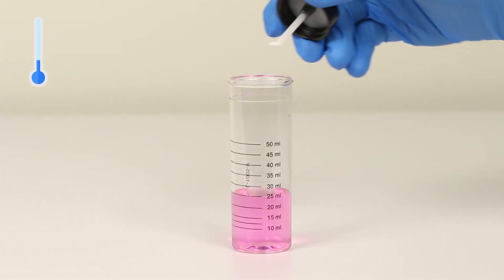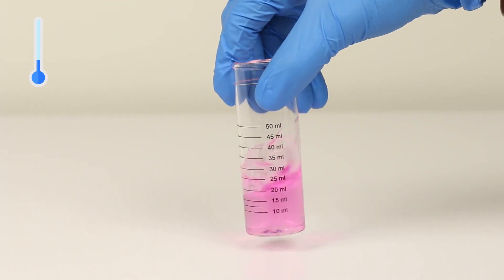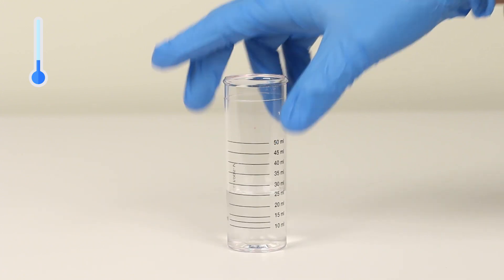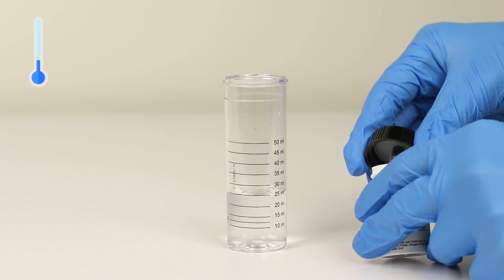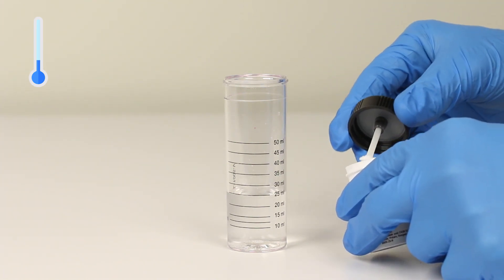Next, add starch acid indicator powder one scoop at a time until the sample color changes from pink to colorless. Swirl the vial after each scoop to properly dissolve the powder. Once the sample has turned colorless, add two more scoops of powder and swirl to mix.